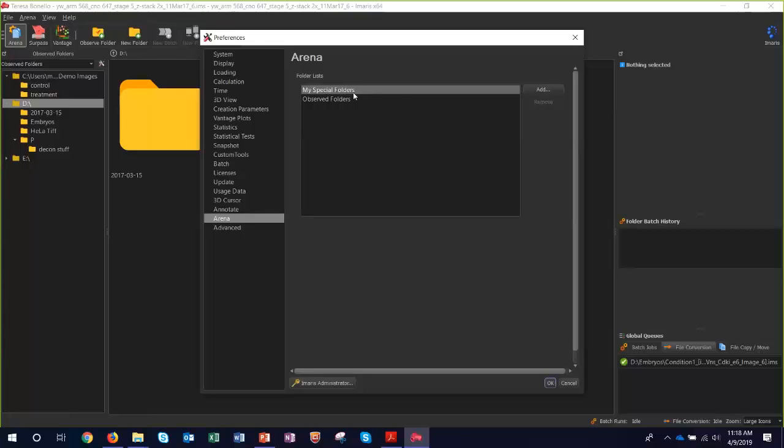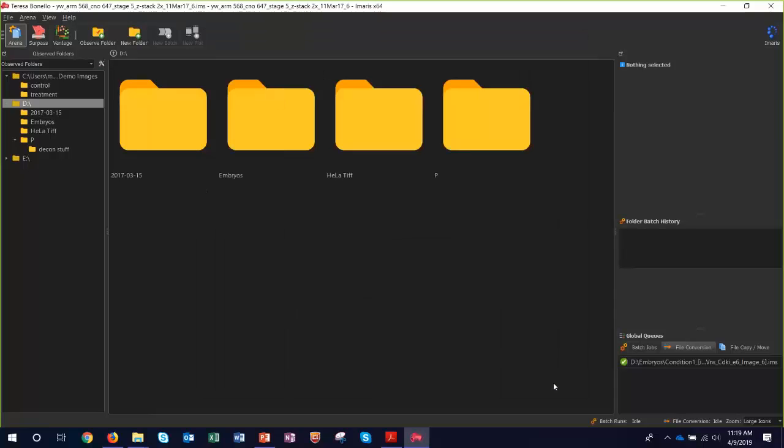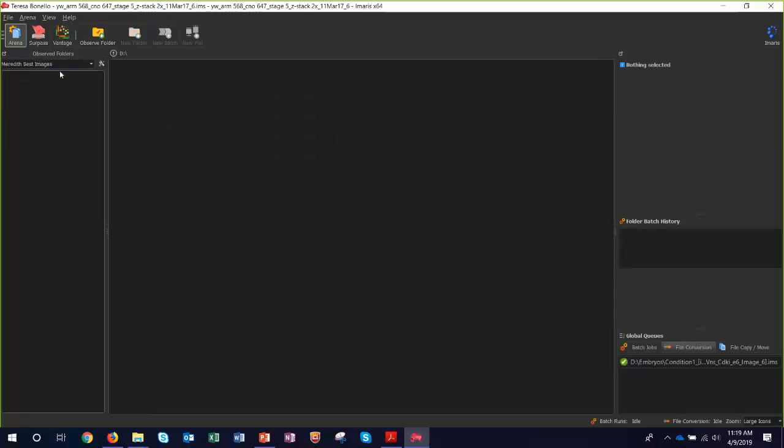So instead, what you can do is you can go in and you can click Add, and you can call it Meredith. How about that? And so I now have that. I'm just going to click OK. And over here now within the drop-down, I've got a new list.